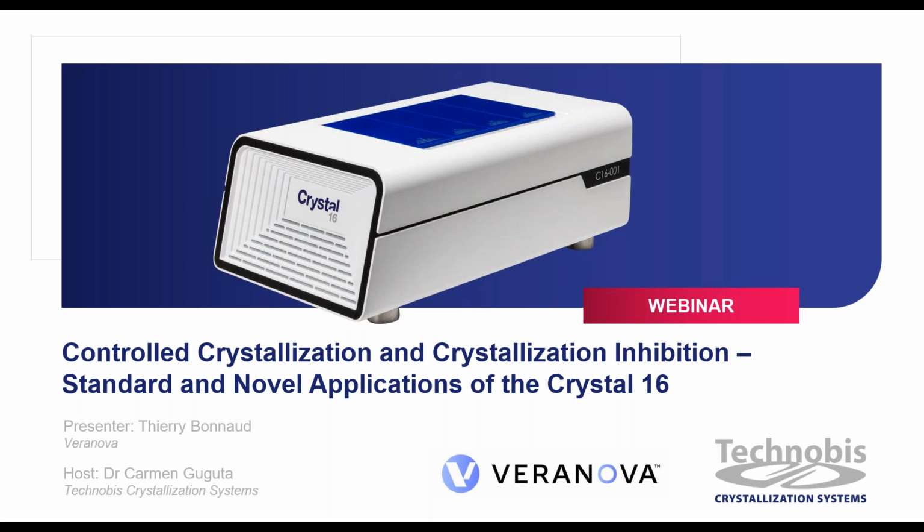I'm happy to present to you this together with Thierry Bonnaud from Veranova, this webinar on control crystallization and crystallization inhibition, standard and novel applications of the Crystal 16.